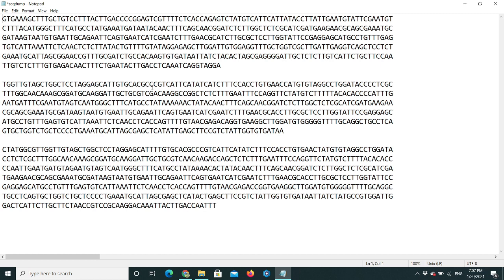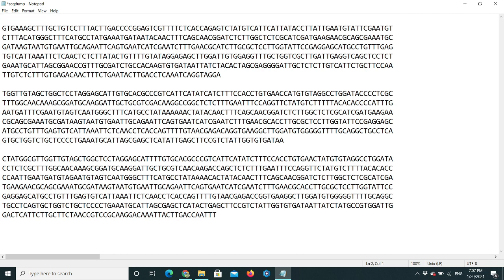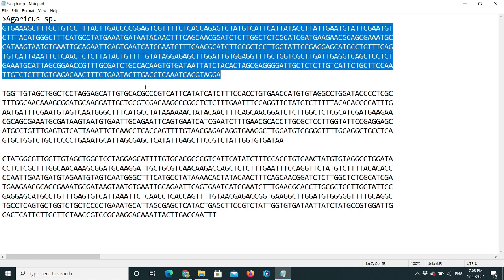First, let's format these sequences. As you know, we have two lines for FASTA format: the first is the definition line and the second is the sequence line. In the definition line we have to insert a greater-than sign and then the sequence identity. These sequences actually belong to fungi, genus Agaricus, so I will type Agaricus species. The second line is the sequence itself.